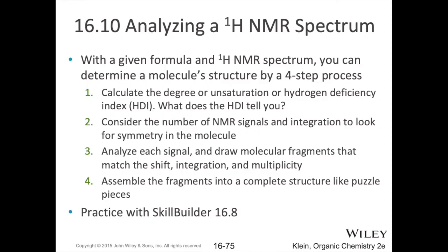Okay, so once you've got the pieces together, start looking at things like the multiplicity and try to get a feel for what pieces are connected to each other, and think about how near they might be. Once you start getting a picture in your head of what the molecule might look like, or you do trial and error your way towards it, use this to confirm if you're on the right track.